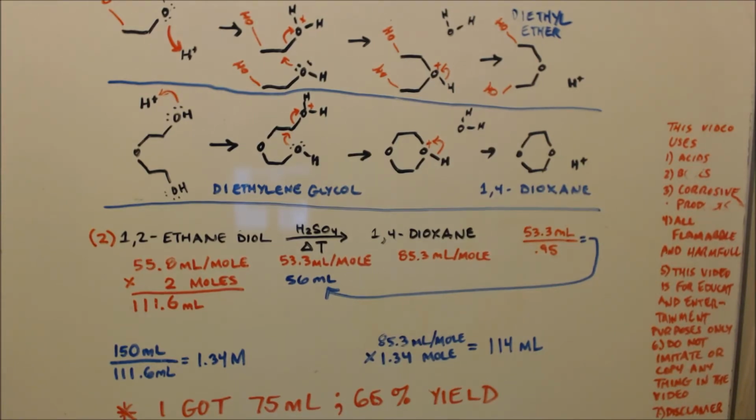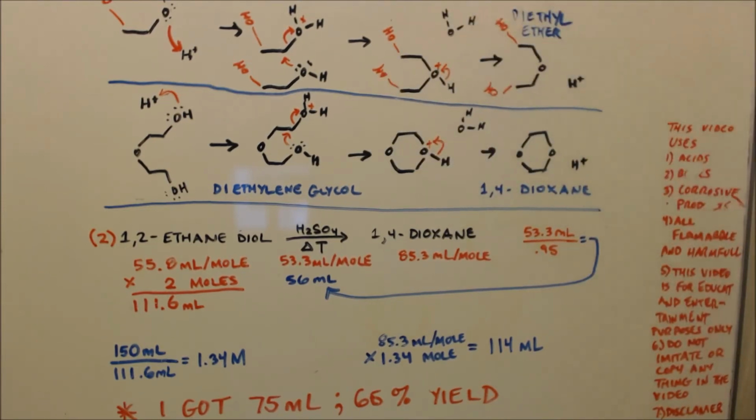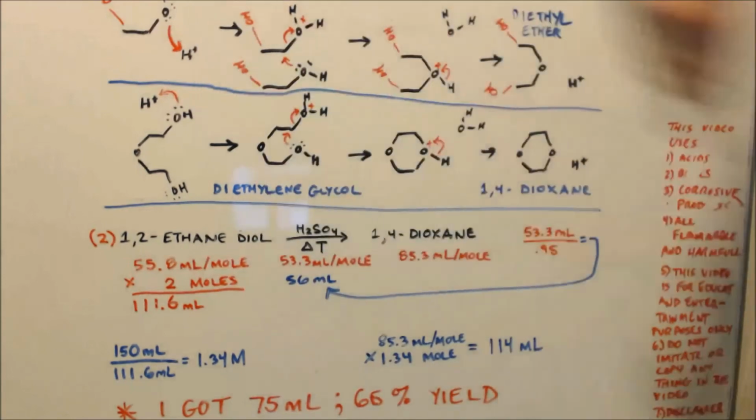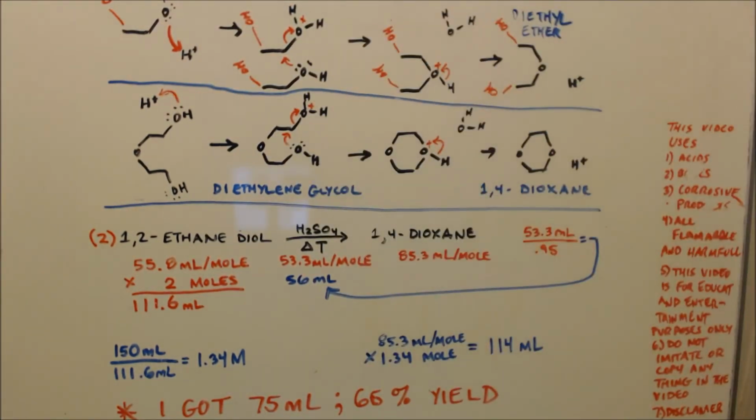Of course, this is a dehydration reaction. So the more I have, I got to soak up this water as it comes off, right? It'll push the equilibrium, but it'll go back. You don't want your water going back onto the alcohol. So if I double it, it'd be 15 milliliters. And I figured, well, I'll throw a little bit more, make it 20 milliliters. Can't hurt. And that's basically it.